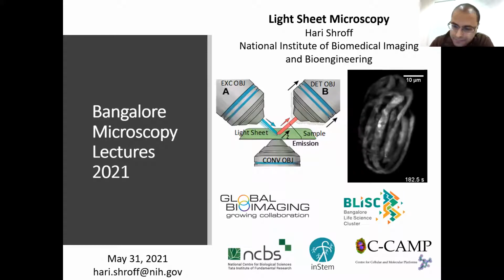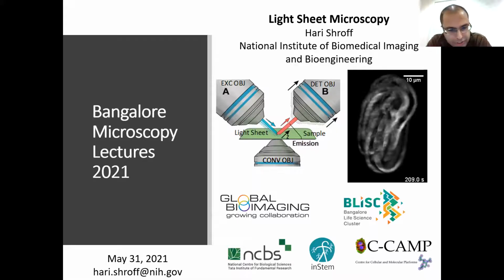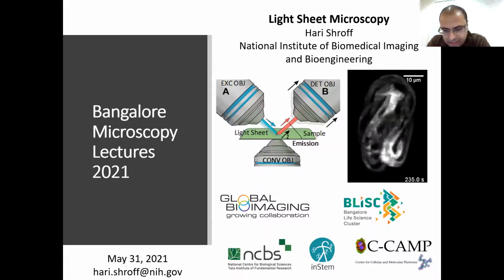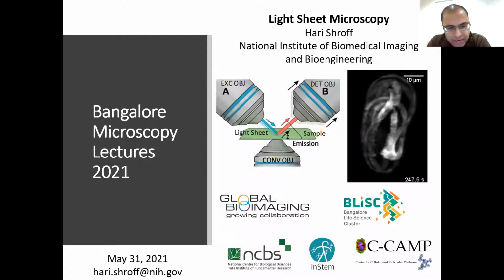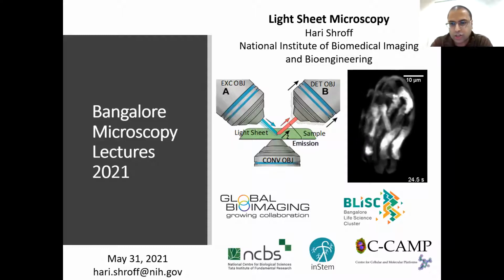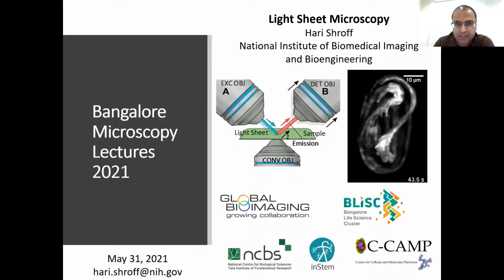So light sheet microscopy is a very diverse topic, and so my intention here is to provide some basics and then provide a couple of specific examples. But really, hopefully, this is just a springboard and launching off point for you to learn more about this technique.